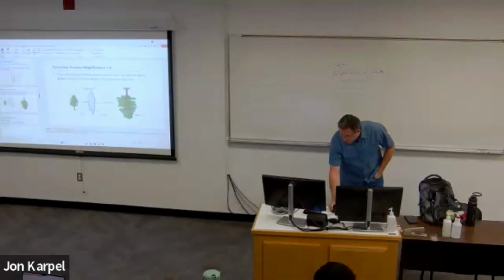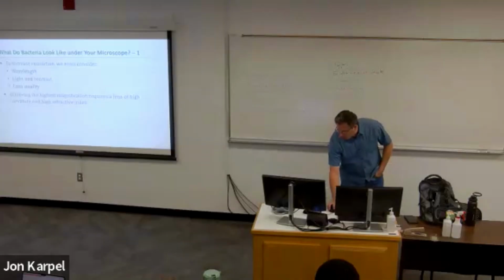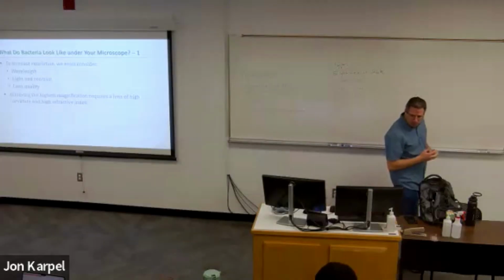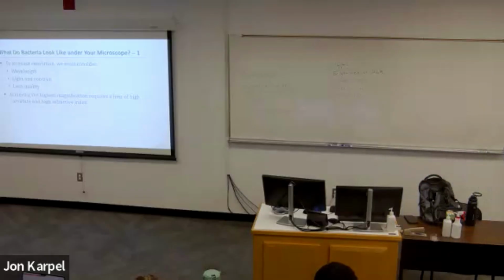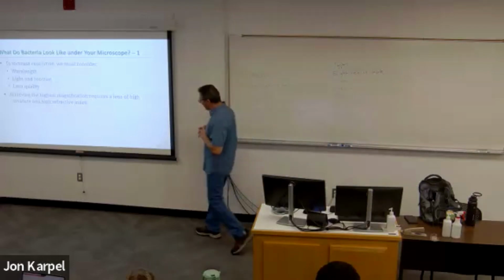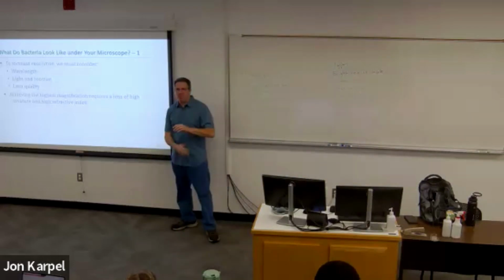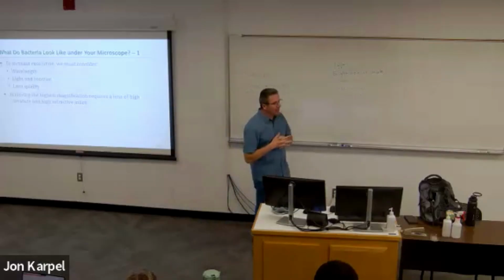I have one more, but I'll come back to it. It goes along with this slide here. Okay, bright field. With bright field, you have to think about wavelengths, contrast, and lens quality. Of course, we don't have the top of the line microscopes here at the university, and they tend to get beat up a little bit, so we have to be nice to them and clean off the objectives.